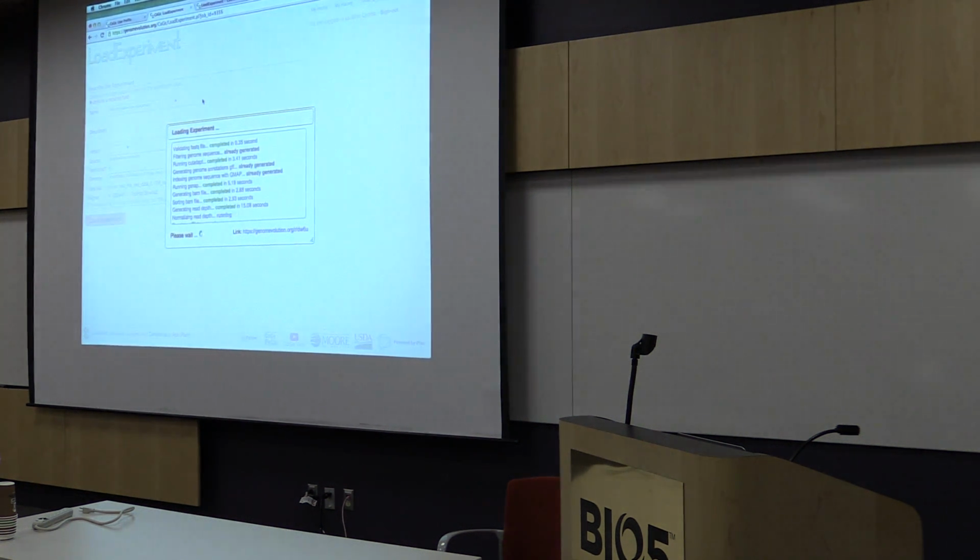It's still trying to load the experiment. I hit okay. Eric, I think you're the only one that's allowed to do it. Did yours work? Yeah. And you're on a Mac. Everyone else has a Windows machine. I do Linux. Jerry thinks it works. Apparently you have to be an iPlant person. No, but you guys all got to fail. Let me pick someone's computer to do it.